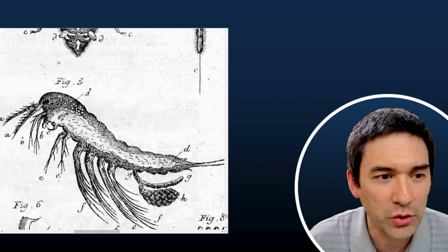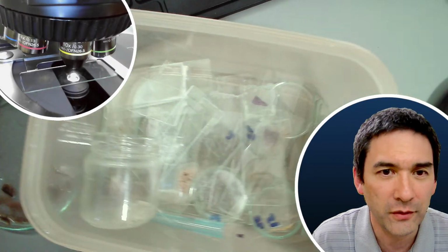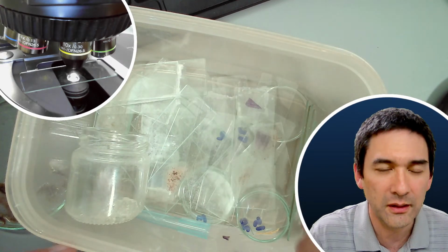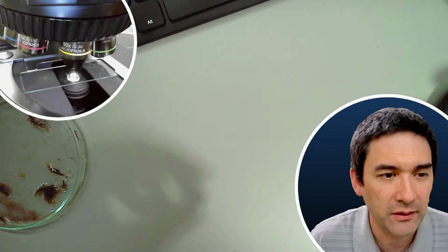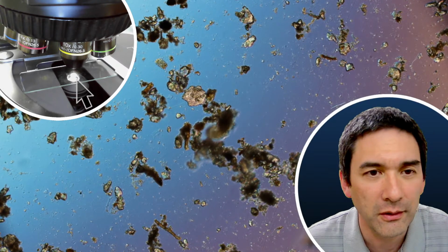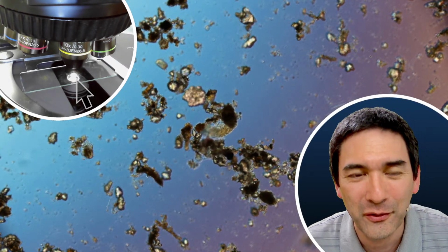I'm going to switch over to the desk. So these are all the boxes of used slides, and I simply collect them and then I clean them, just to save a little bit of glass. Here we still have the water bear. I'm almost a little bit afraid of moving away here.